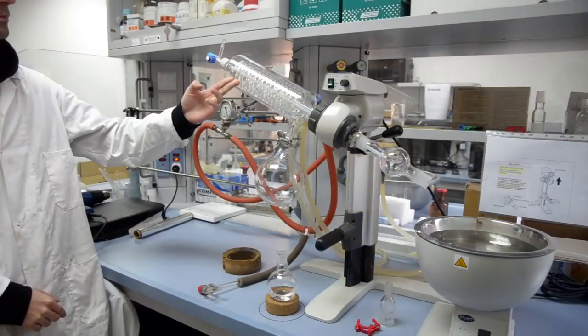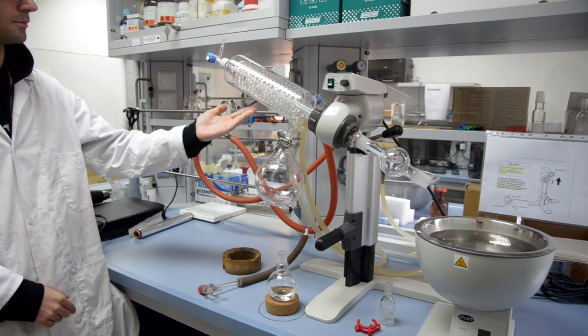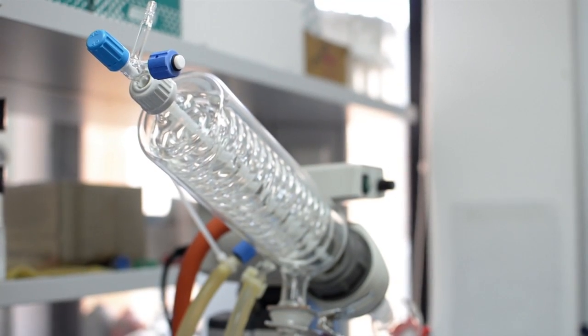The Condenser. This is where solvent condenses as it comes into contact with a regular flow of water which acts as a coolant.